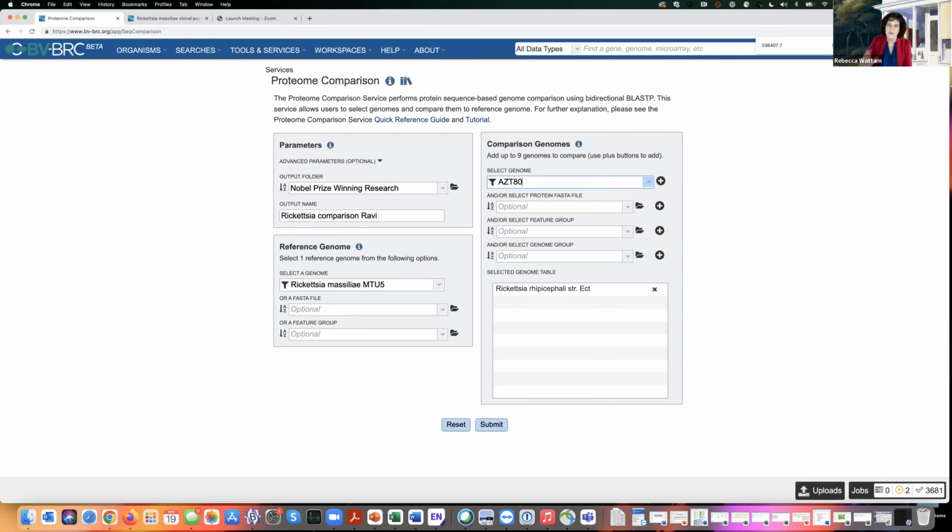I'm just trying to show you how you can take different things here. Now look at this. There are two of them here. Which one do I use? I think I'll use this one. This indicates to me, I think it's a second initial sequence by, I believe, Rocky Mountain Biological Lab, but I'll just choose this one. And then I had my private genome that I wanted to look at, which, in this case, I could even add the genome ID number for my genome that I liked the best.